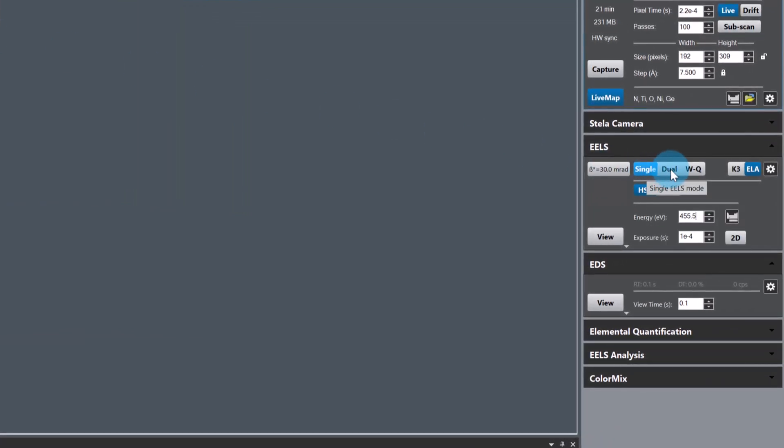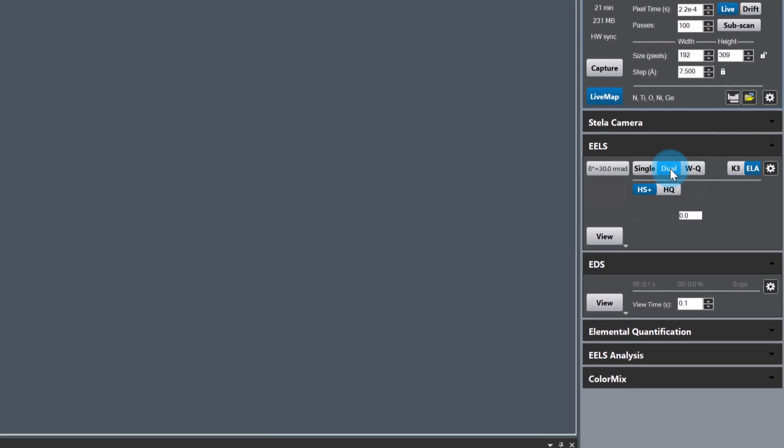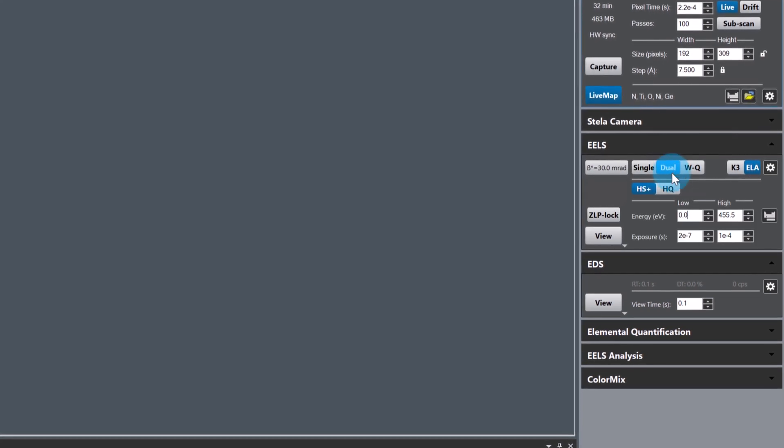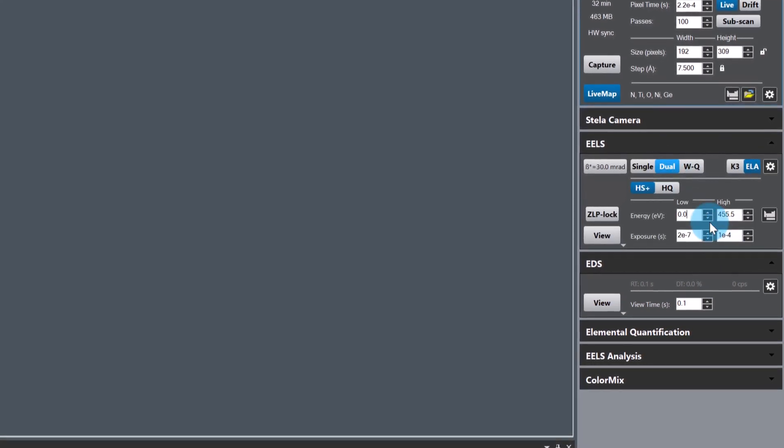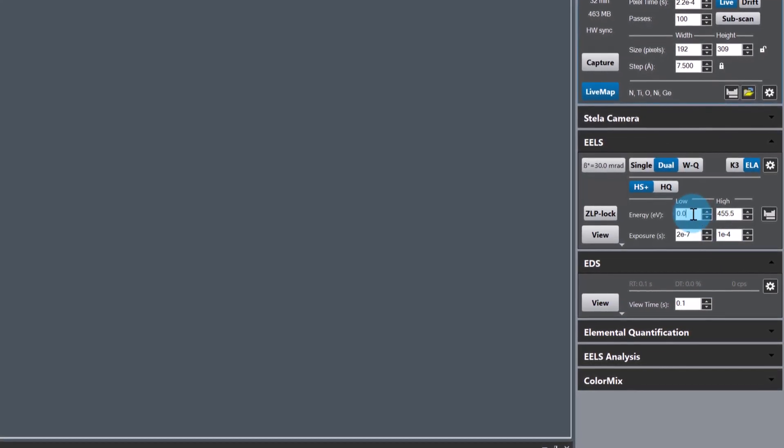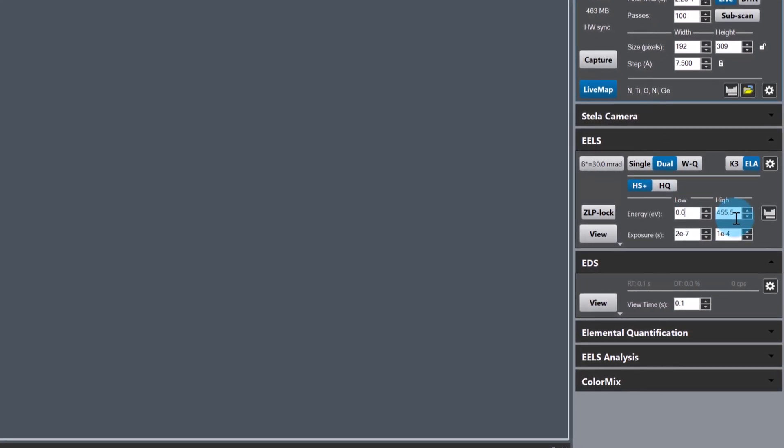Now choose an energy loss and exposure time for your low loss spectrum and do the same for the high loss spectrum.